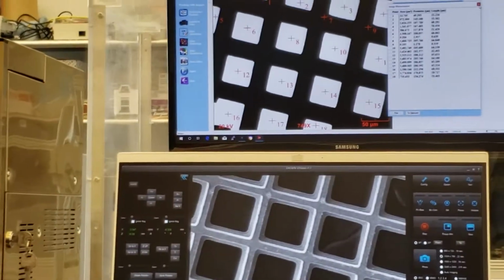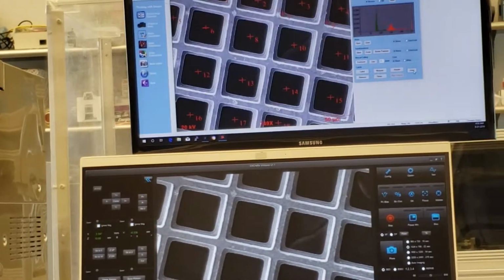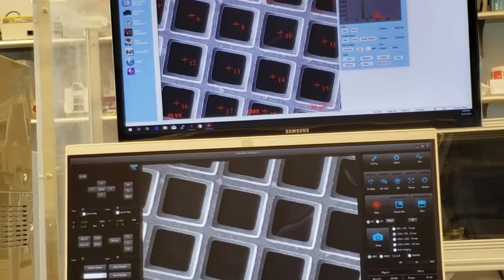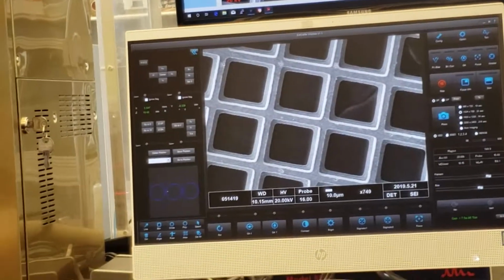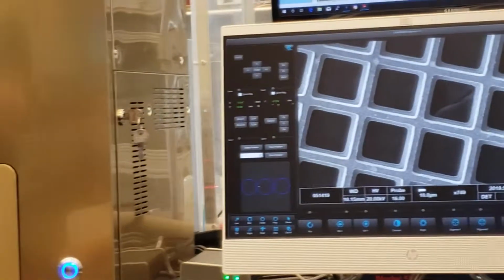So anyway, that was just me playing around with some imaging manipulations. Okay, great. Back to the image. Okay, so now again, and then we can view this in 3D if we want to.